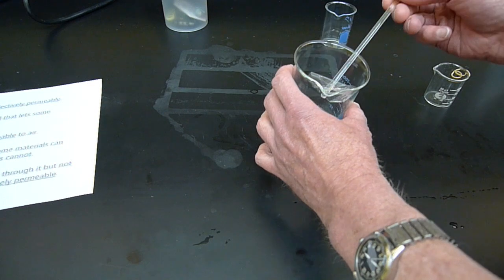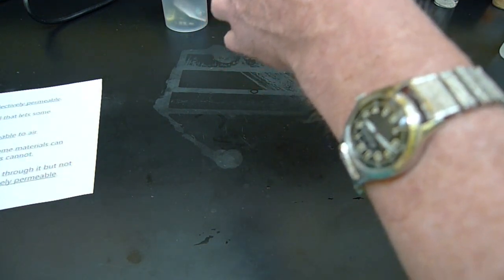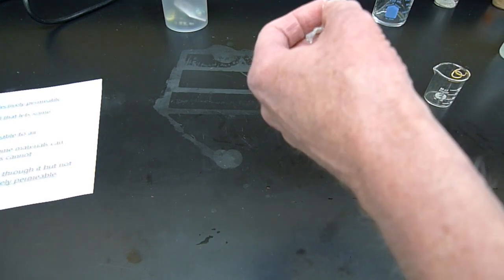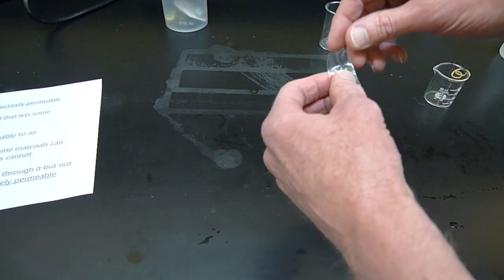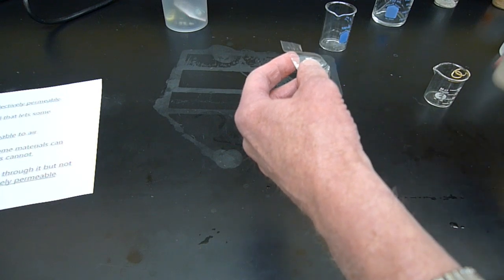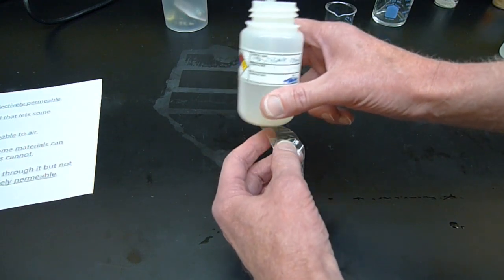But for now, we're just using this dialysis membrane. This is a simulation of a cell membrane, but again, it's mostly just a matter of size, because it has pores through it. It can either let stuff pass or not. I'm going to put two different solutions in here. I have some starch solution, and I'm going to put that in there.